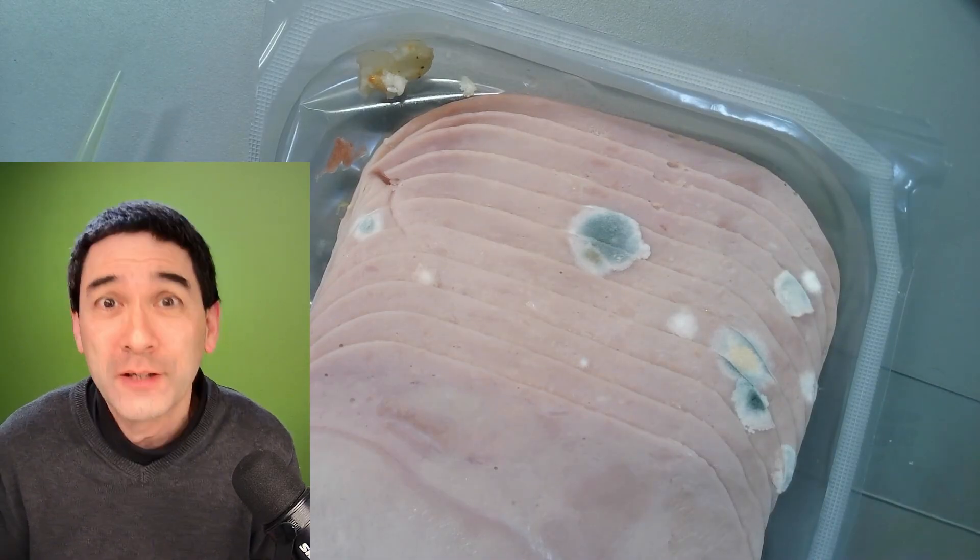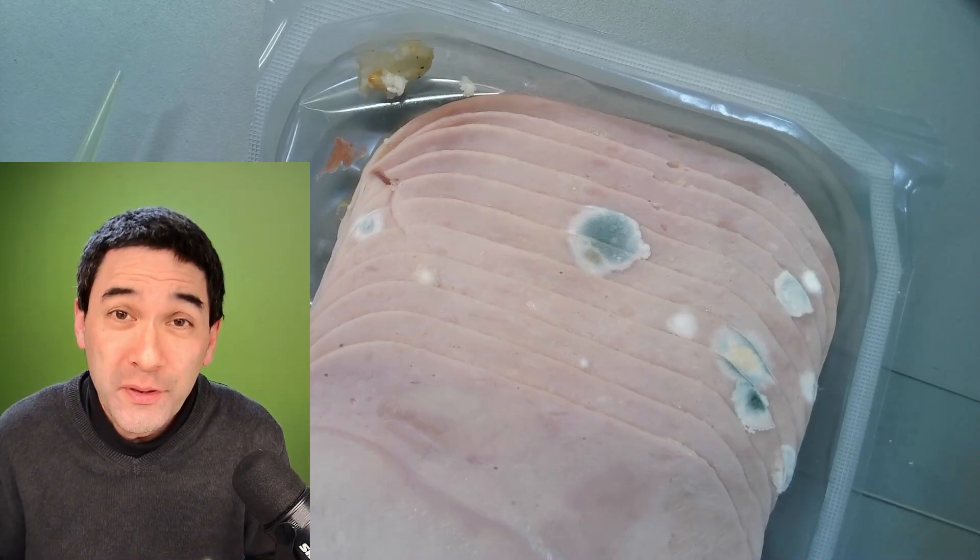The ham has already been opened, therefore of course spores and bacteria from the air could reach the ham, and therefore it spoiled fairly quickly, even though it was in the fridge the whole time.